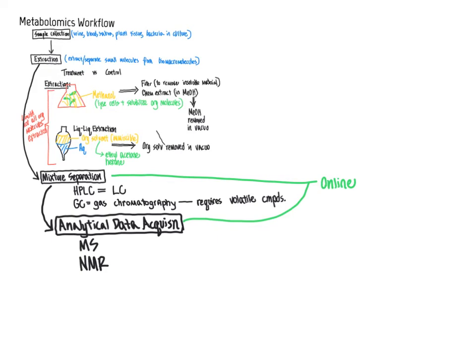When we refer to NMR, most commonly it is going to be proton NMR that is applied in metabolomics analyses because proton NMR spectroscopy is more sensitive than carbon NMR spectroscopy because of the fact that the nuclear magnetic resonance active hydrogen is hydrogen 1, the most common isotope, whereas the NMR active carbon is carbon 13, and that carbon 13 isotope is definitely not the most naturally prevalent type of carbon.